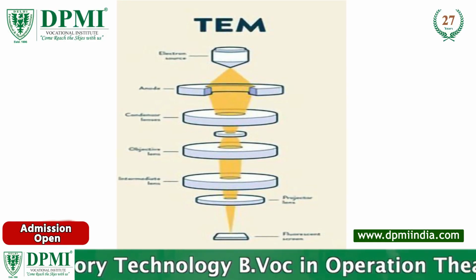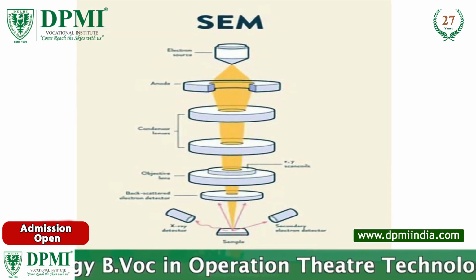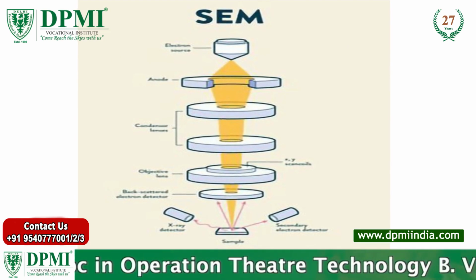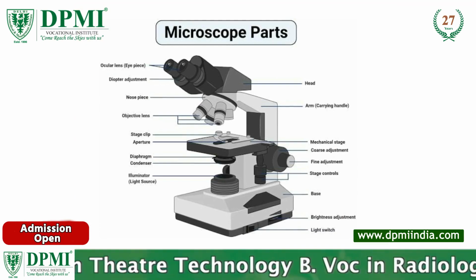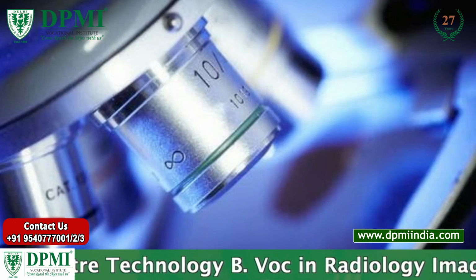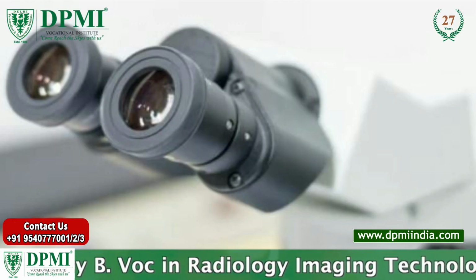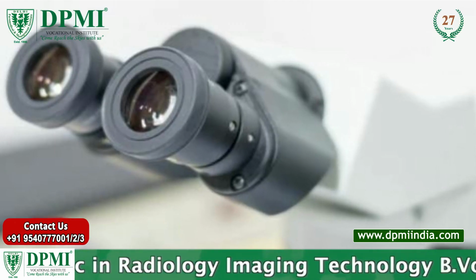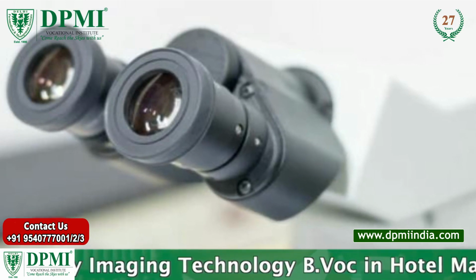Types include transmission electron microscopes (TEM) for thin specimens and scanning electron microscopes (SEM) for 3D surface. Basic components of a light microscope: the objective lens magnifies the specimen. The eyepiece, or ocular lens, further magnifies the image formed by the objective lens.